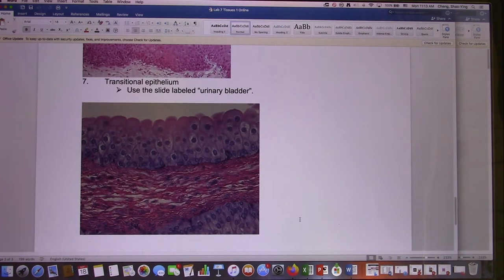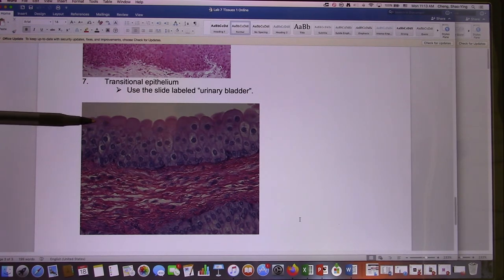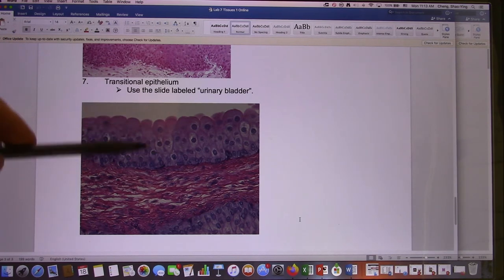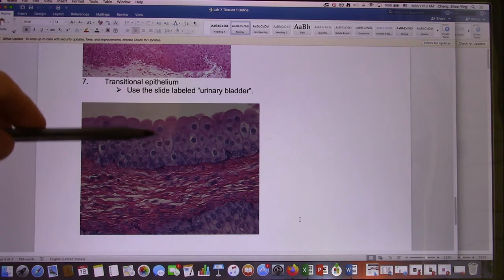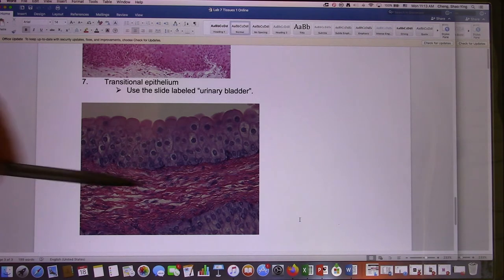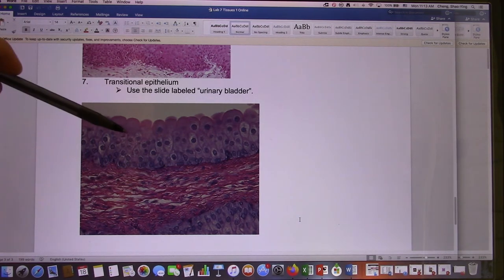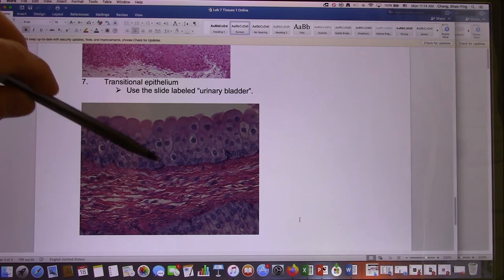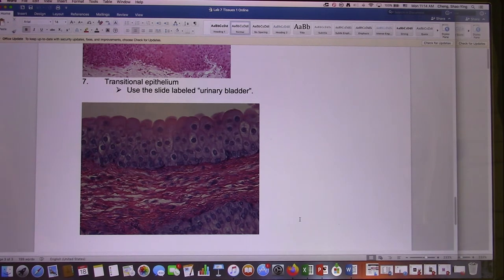And the last one: transitional. Transitional is multiple layers but the number of layers changes. You won't be able to see the number of layers change on the microscope, but you can use the shape — they have a cuboidal or bubble shape. This is from the bladder. During the test I will point here and ask you what kind of epithelium it is. The answer will be transitional — they have that bubble shape and it's multiple layers, a unique multiple-layer type called transitional.